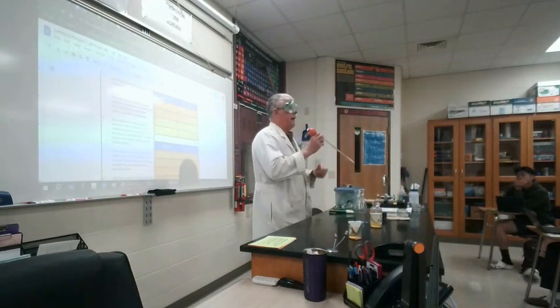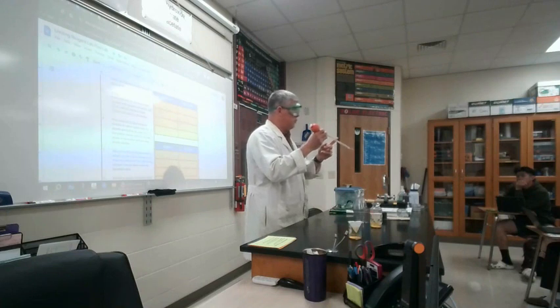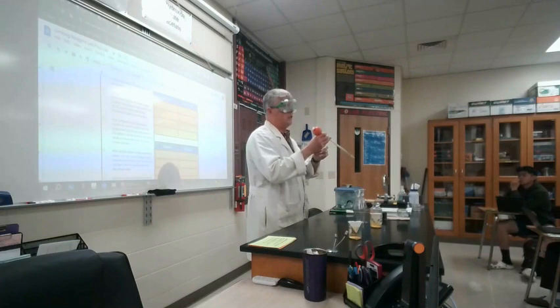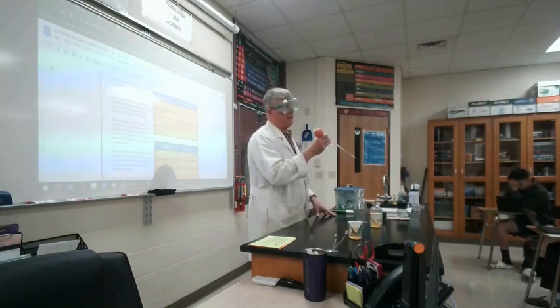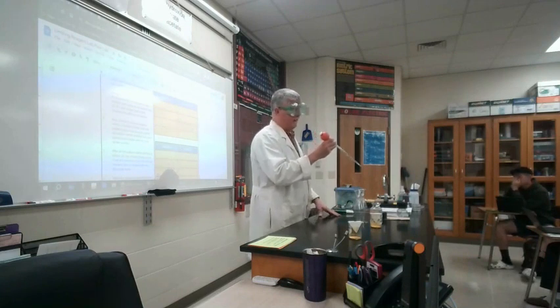Now, depending on what volume you have, you may only have to use 5 milliliters. You may have to use 5 and 10 to make 15. You may have to use this twice to make 20. You may have to use this 3 times to make 30. Or twice and 5 to make 25. I'm not telling you anything you don't already know how to add to 25.